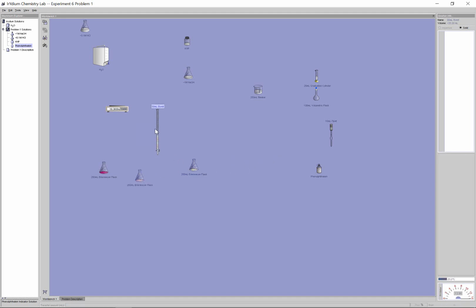I technically do have enough volume, so my burette here still has a reading of about 31. If it's only taking about 9 mL, I will only be down to about the 40 mark. I just want to make sure I'm not past the 50 mark, even though the burette will still have a little bit of volume below the 50. If I pass the markings, I can no longer read the final volume, and I have messed up the experiment. So just to reassure me a little bit, I can actually reload the burette at any time I want.